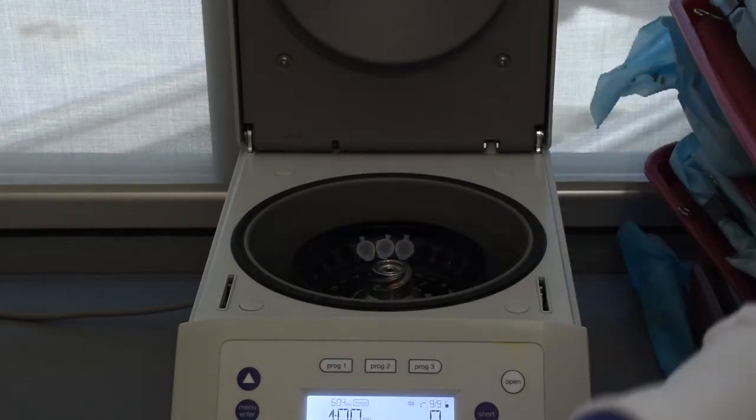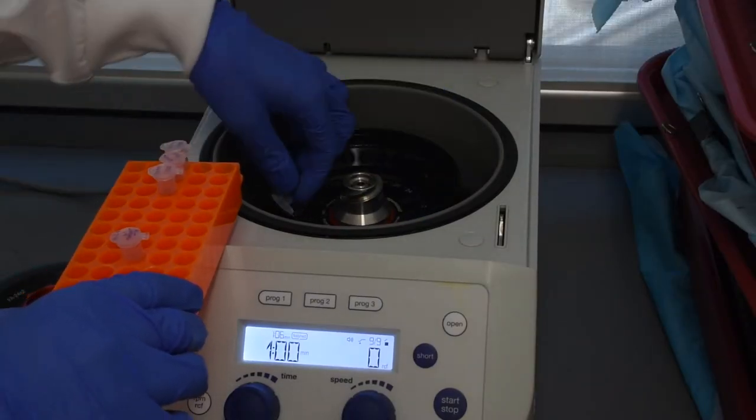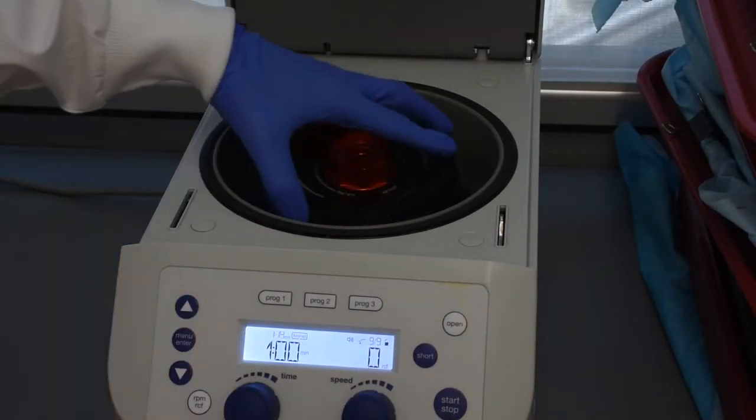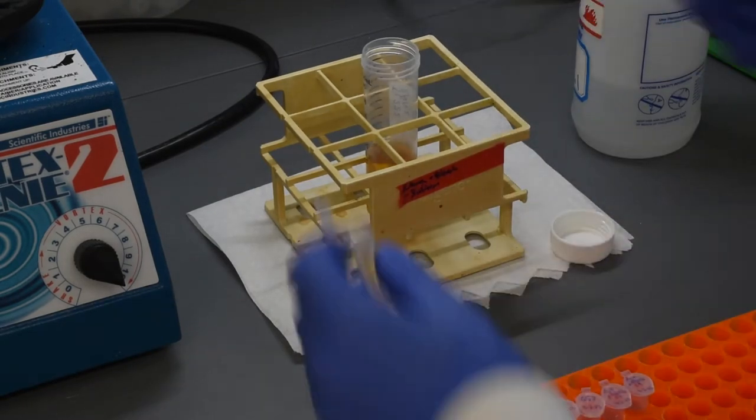Centrifuge again at the same settings. Pour off the supernatant and return the tubes to the rack.